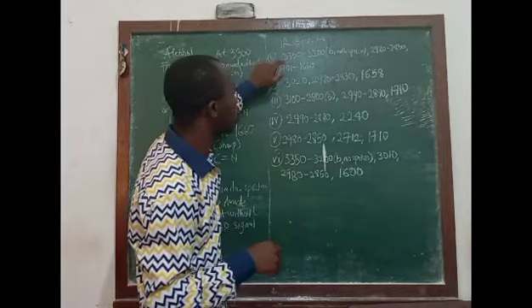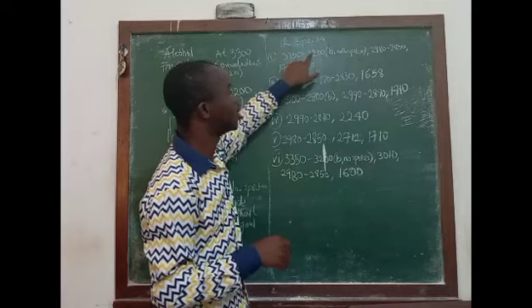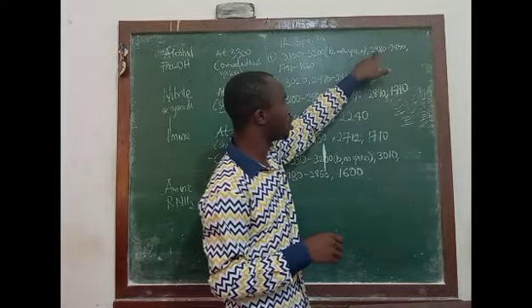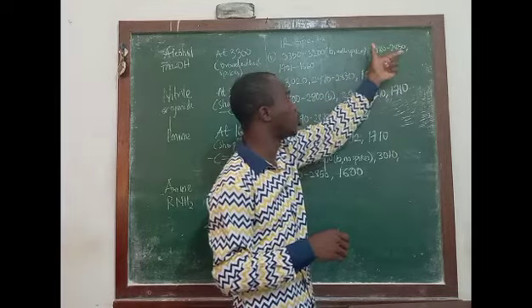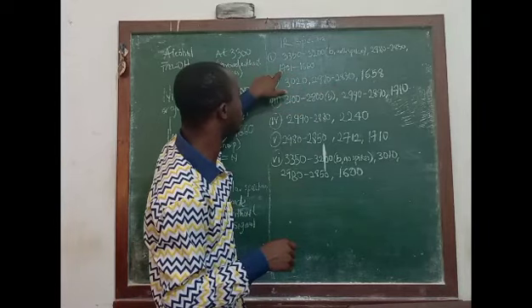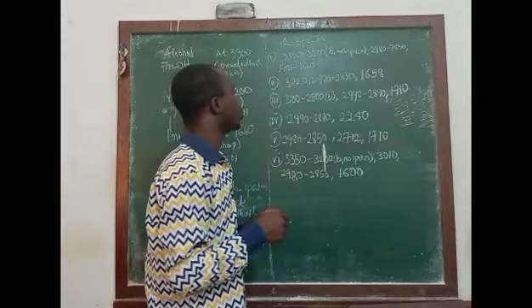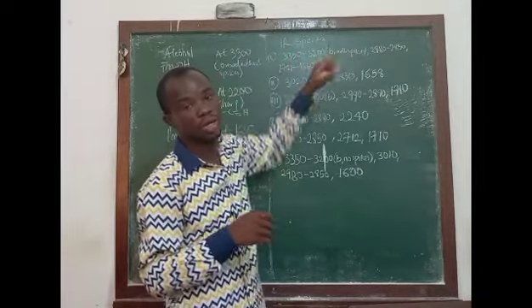So starting with the first one, we have a signal between 3,350 and 3,200, which is broad. B means broad, and it is with spikes. At the same time, we also have a signal between 2,980 to 2,850, which is just below 3,000. At the same time, we have a signal around 1,701 and 1,660. Now the question is, what does this represent? What compound does this spectrum represent?